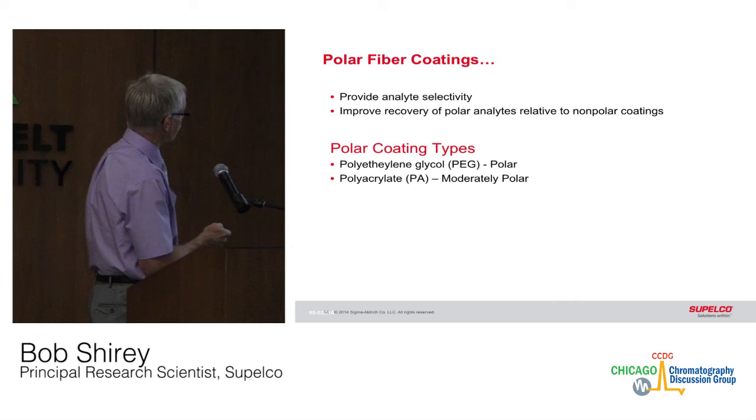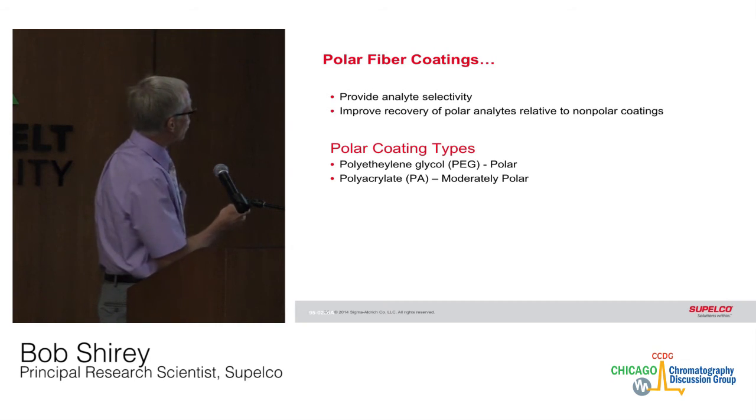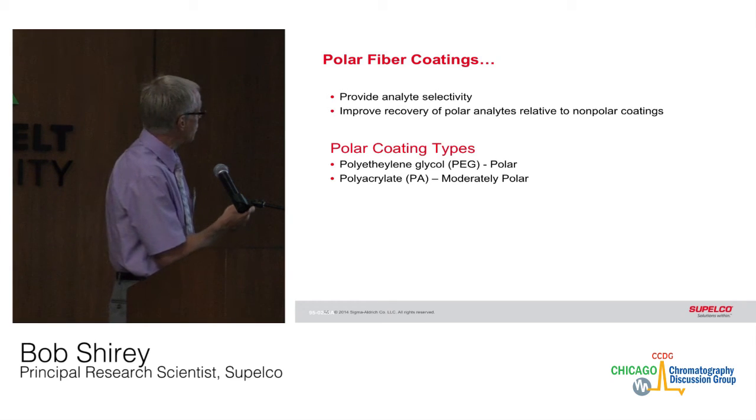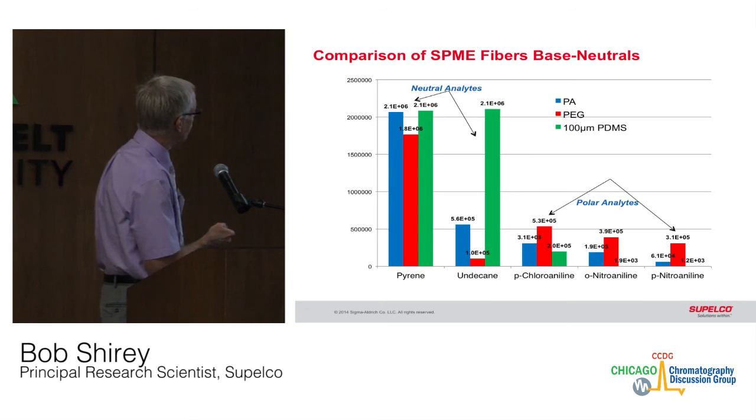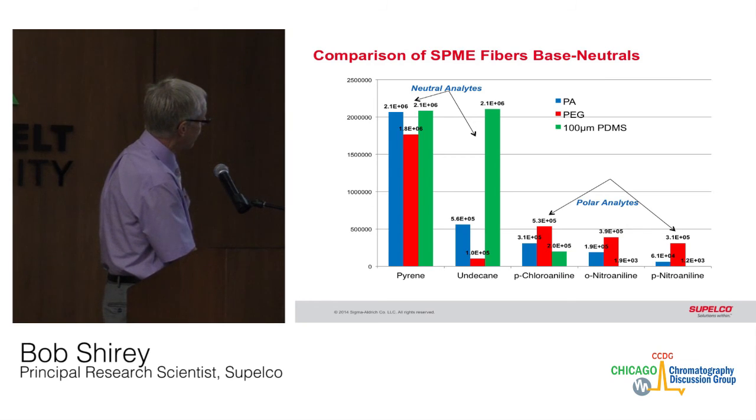The polar coatings, of course, determine selectivity. Polar coatings will extract polar analytes better. And there are 2 types that we have right now: polyethylene glycol, which is the most polar fiber, and the polyacrylate, which is moderately polar. This slide shows the effect where the polar analytes are extracted very nicely by the PEG fiber and moderately well by the polyacrylate, where the PDMS is 3 orders of magnitude less for paranitroaniline than the PEG fiber.